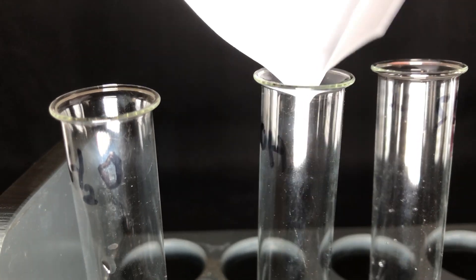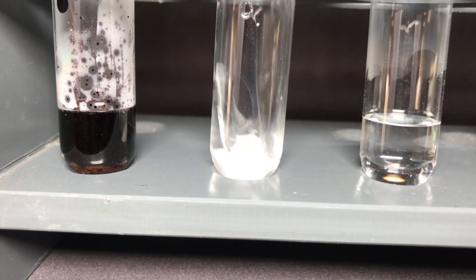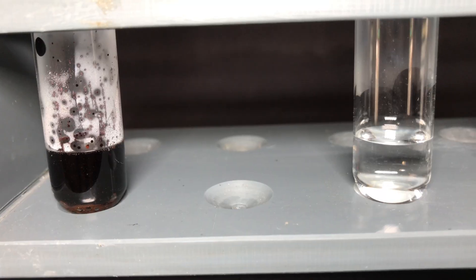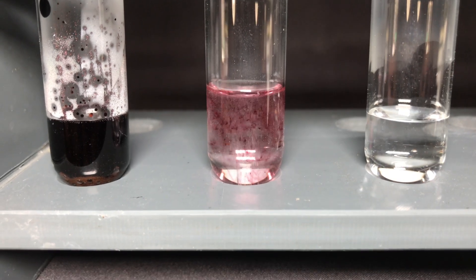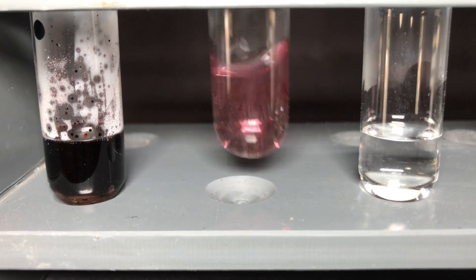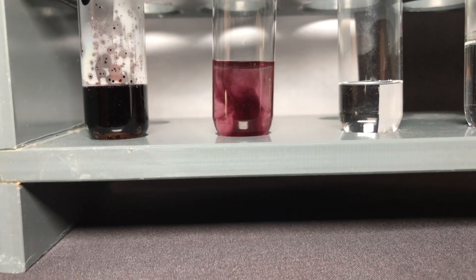In alkaline solutions ferrate does not decompose as quickly. Therefore we used some potassium hydroxide in water and then added the ferrate. Potassium ferrate powder might look black and boring, but as you can see when you put it into an alkaline solution you get this beautiful reddish solution.